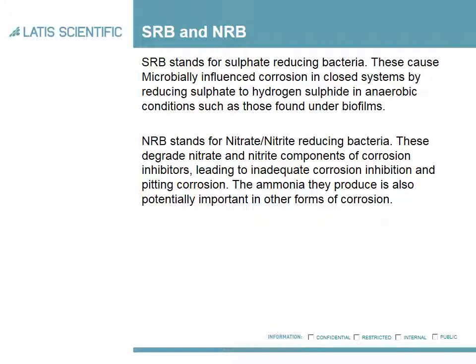There's a 5-day and a 21-day test, and the 5-day test is becoming less and less popular because, although it's quicker, it's less reliable, and to get the same level of confidence in your results as doing the 21-day test, you would need to do at least 7 replicates of it. This is discussed in some detail in the appendix to BS 8552. NRB stands for nitrite reducing bacteria.